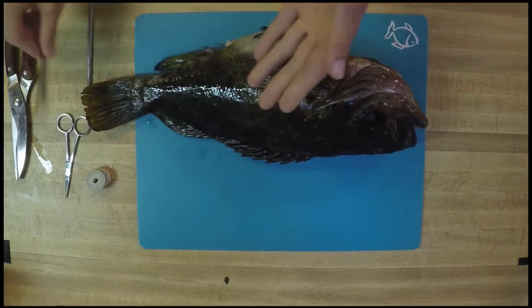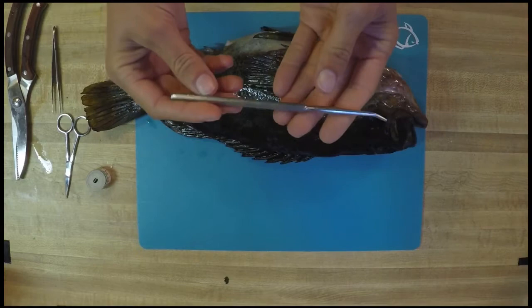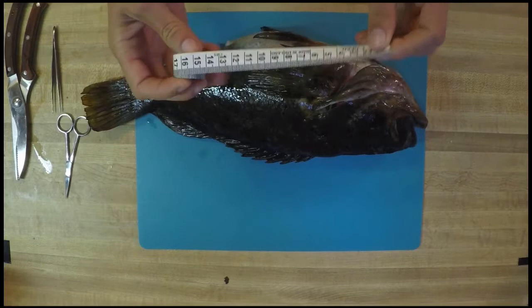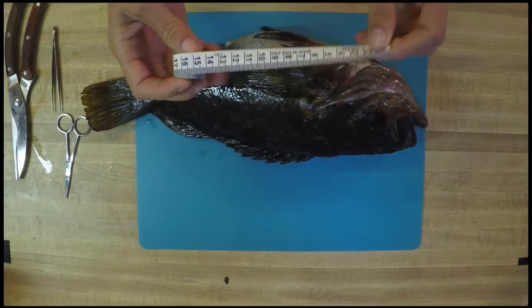Just some first aid tweezers will work fine. We also have this probe — a probe is for poking things and checking things out. If you don't have a probe, then a pencil should work just fine. Lastly, we have a tape measure. This is a fabric tape measure, but if you want to just use a normal construction tape measure or even a ruler, that can work great as well. And we're going to start off with the exterior of our fish.